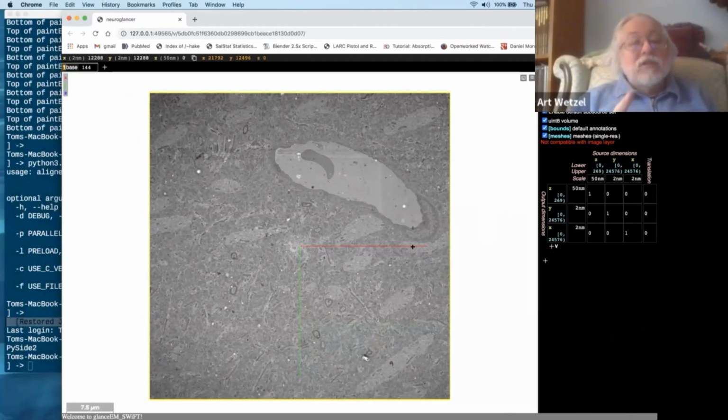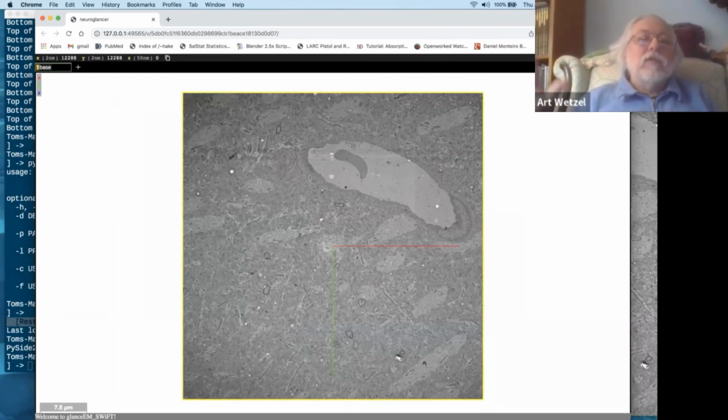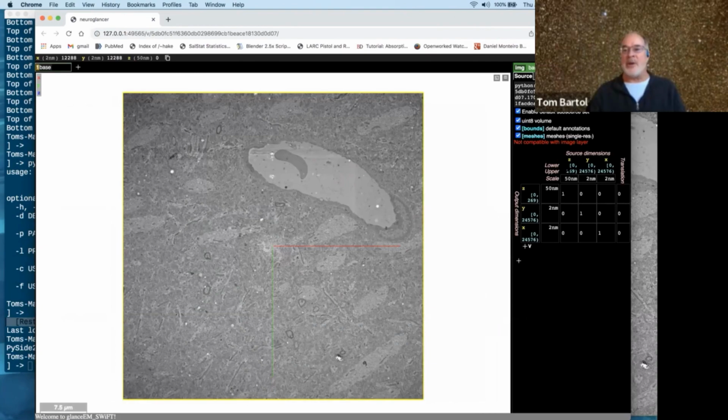I should add, this is important not just visually. It has to do with the efficiency of stepping across pixels between the original image space and the views that we see here. Exactly. And so the order ZYX is important for efficiency of stepping through.